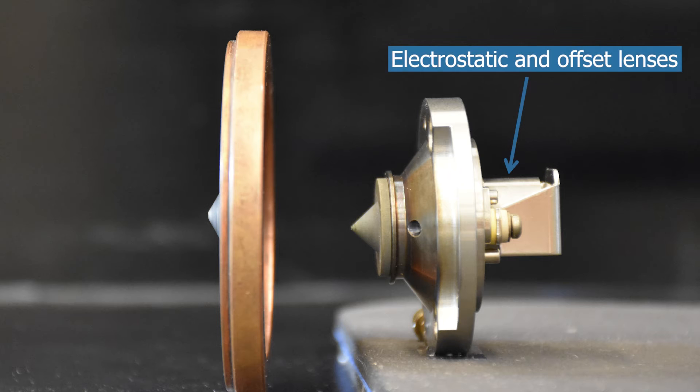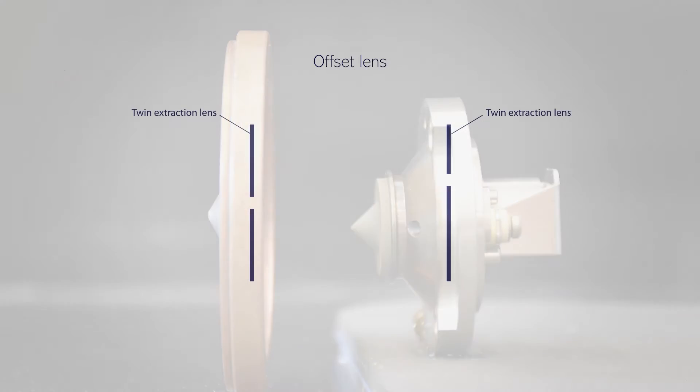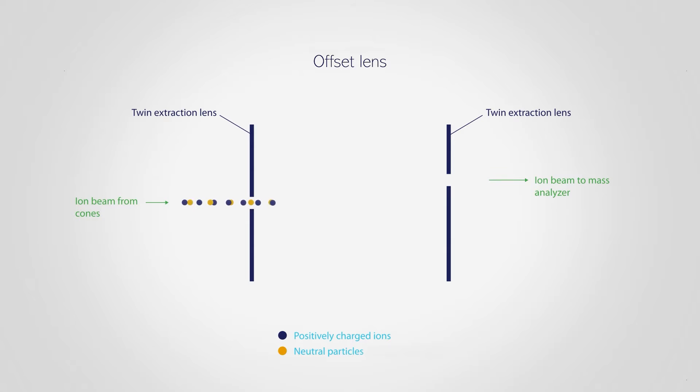In the mass spectrometer, the ions pass through two electrostatic lenses, which focus them, and then through an offset lens. In the offset lens, a strong electric field deflects cations upwards towards the collision cell. Uncharged particles and photons are not deflected and do not proceed. This improves system performance by reducing background signal.